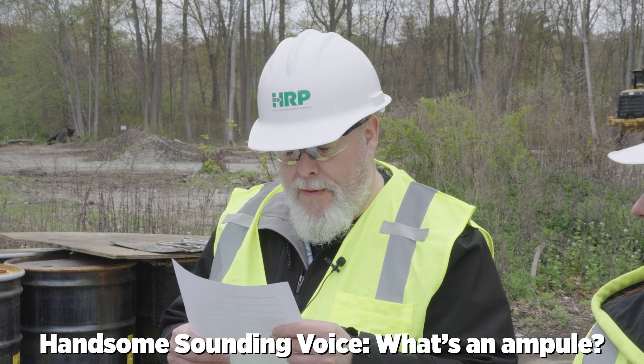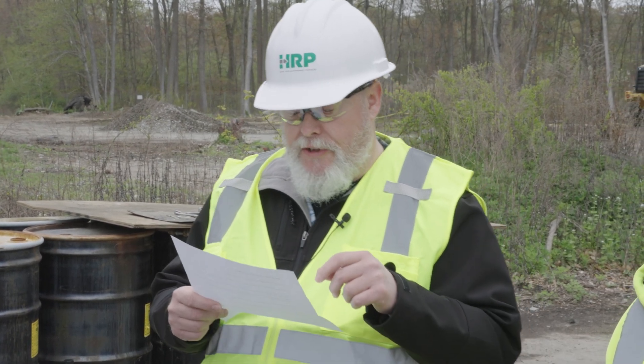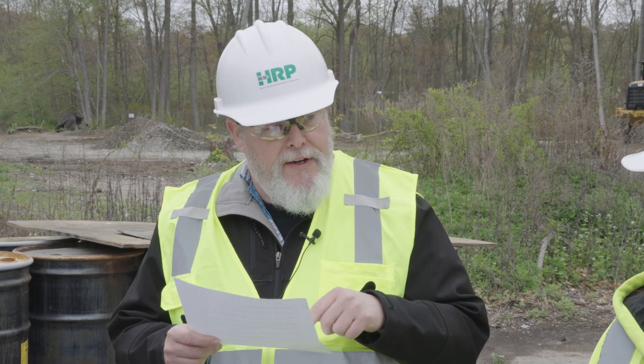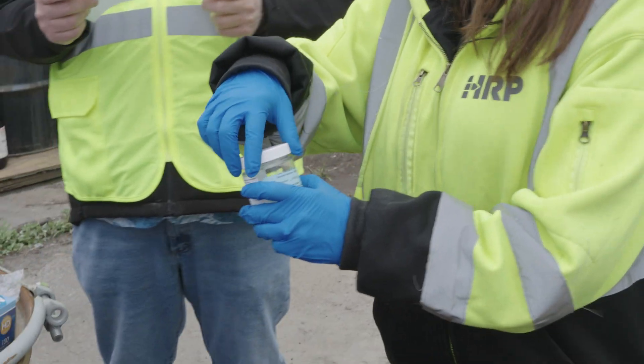You would break the elongated end of the ampule. An ampule is a small sealed vial which is used to contain and preserve a sample, usually a solid or liquid. While holding it over the gauze, you use all the contents of the ampule. Then you're going to thoroughly wipe a 100 square centimeter area with side-to-side, then up-and-down wipes.